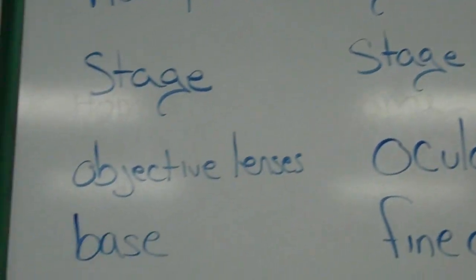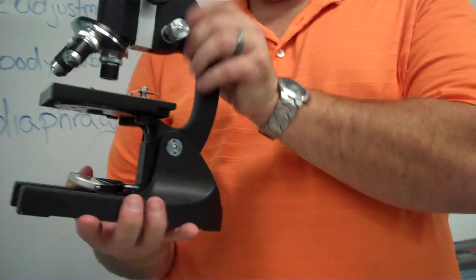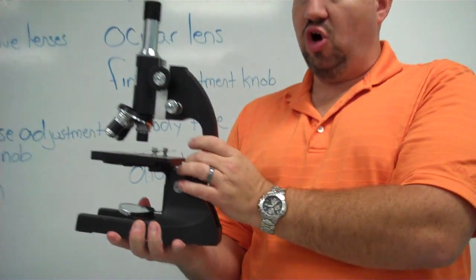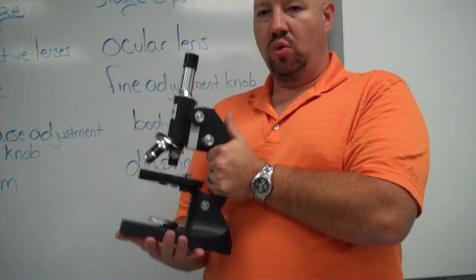When you hold the microscope, you hold it in two hands. The bottom hand is holding what's called the base of the microscope. And the other hand is holding what's called the arm. So when you carry a microscope, it should always be one hand on the arm, one on the base.